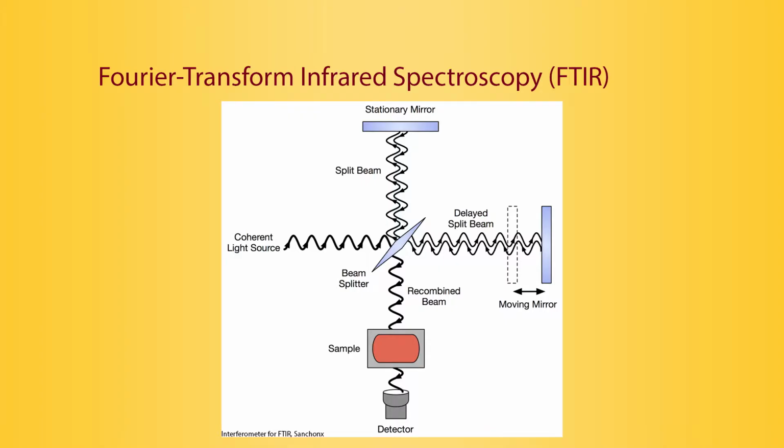To measure the rovibrational spectrum, a Fourier-Transform infrared spectrometer is used. The construction of this instrument consists of a coherent light source and a Michelson interferometer. As one of the mirrors is moved, it creates an interference pattern in the recombined beam, which is passed through the sample and measured. Taking a Fourier transform of the transmission signal versus mirror displacement produces the rovibrational spectrum.